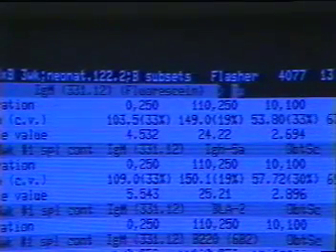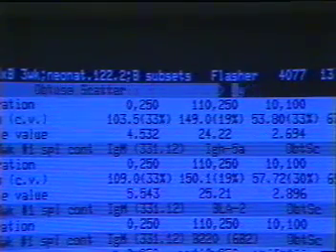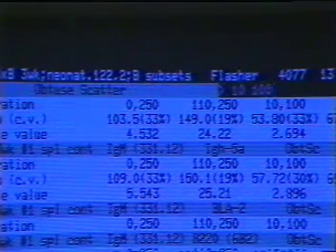To request a histogram, you must assign one parameter to be displayed on the x-axis. Here we'll call for a fluorescein histogram. We press Insert, then press Return to accept the X-axis default for fluorescein. To conclude, we enter gates for the remaining channels.